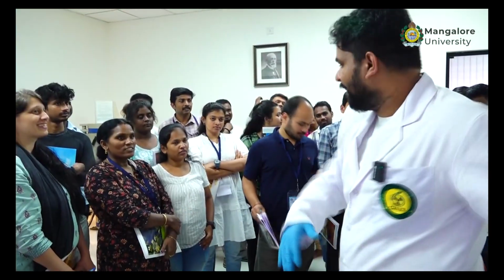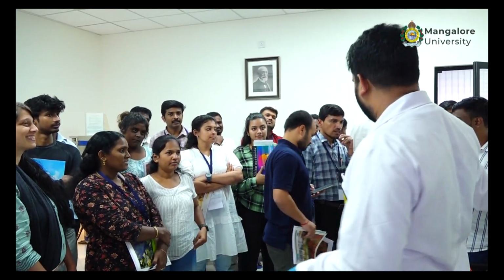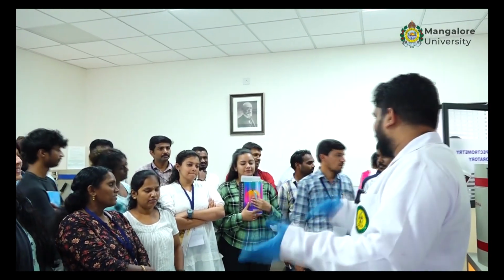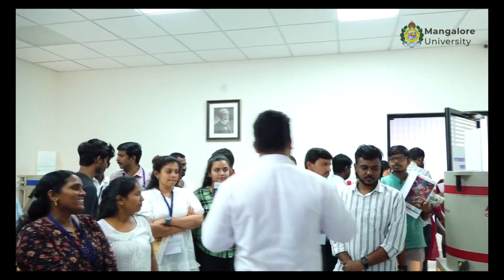By the time I finish the basic explanation of sodium iodide and HPGe, we can start counting. By the time the second batch comes, we can do around like that. One minute, I will inform the same.